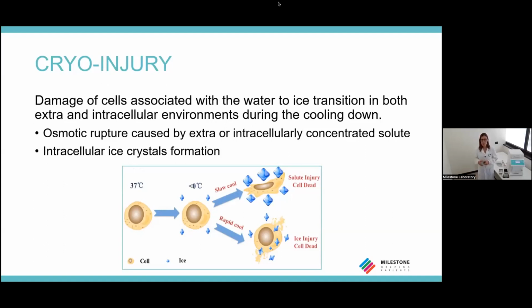These two problems depend on the freezing rate. If the freezing rate is too rapid, water has no time to exit the cell, remains inside the cell, and creates ice crystals. While if the freezing is too slow, we can have a solute injury.